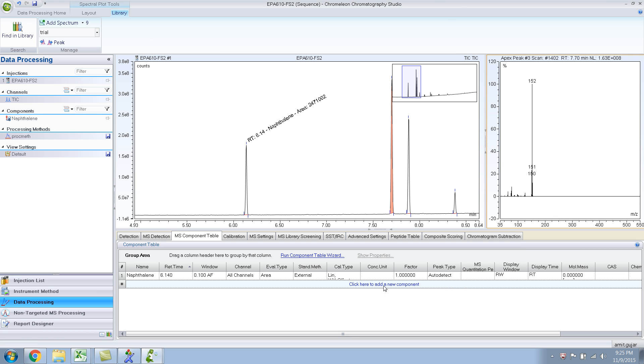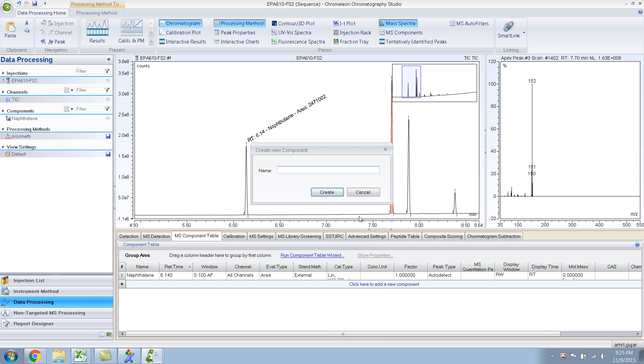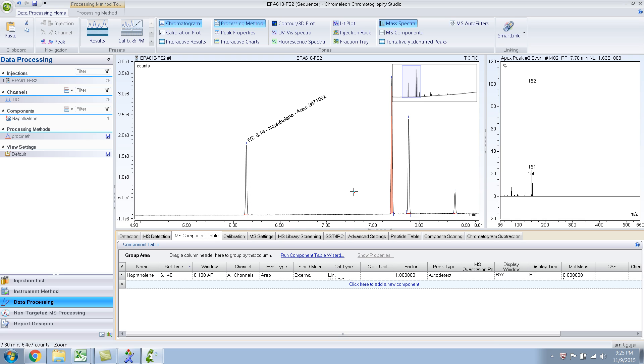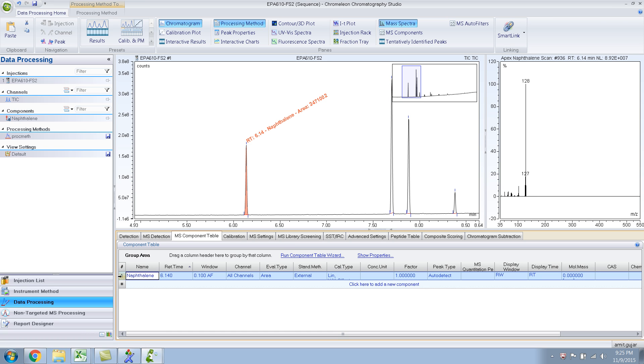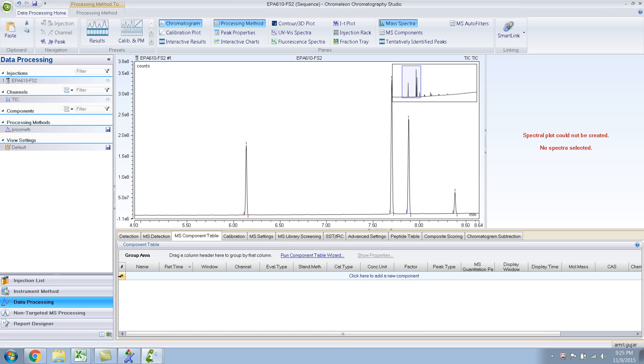So that's acenaphthylene. And similarly, you add your compound, type in acenaphthylene. Anyway, this is one way of adding compounds to the component table. Let me show you another way to do the same thing. So let me delete this. So I press delete and it goes away.